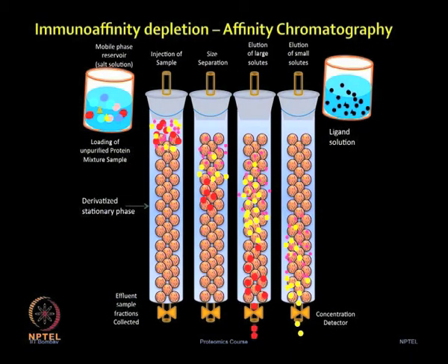So, as you are aware, and in fact, we have discussed the protein preparation from the serum earlier. Each of the biological sample poses lot of technical challenges, and serum is one among them, where presence of highly abundant proteins such as albumin and immunoglobulin, they result into the masking of low abundant proteins.